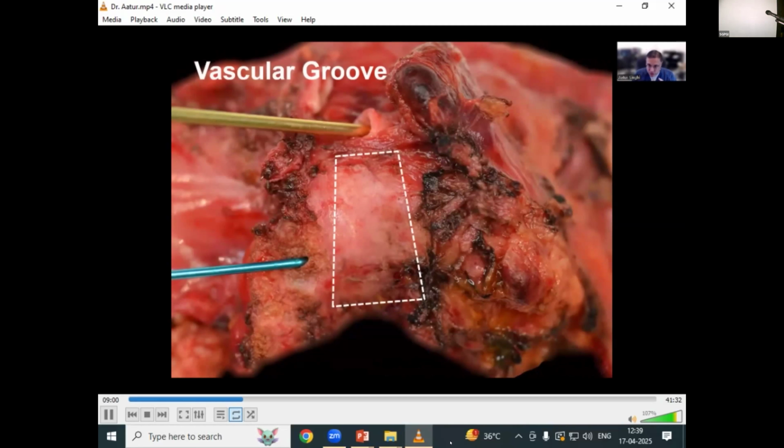The vascular groove is often a trapezoid in shape, where the superior mesenteric vein and artery often rest upon it. And so it's easily released typically when there's lack of involvement of those structures, but just gets dissected away by the surgeon, creating that nice smooth surface as opposed to the cauterized periphery around it. To the left of the trapezoid vascular groove is the pancreatic parenchymal margin that should have an eccentrically placed opening that corresponds to the pancreatic duct. The blue probe is within the pancreatic duct. And at the top of the trapezoid, again, that vascular groove is another opening that corresponds to the common bile duct, as shown here, and held open by the gold probe.